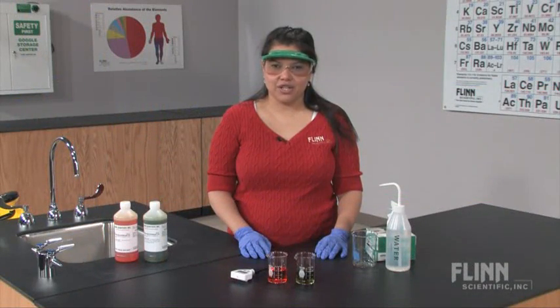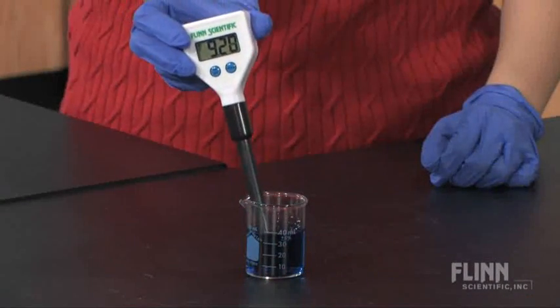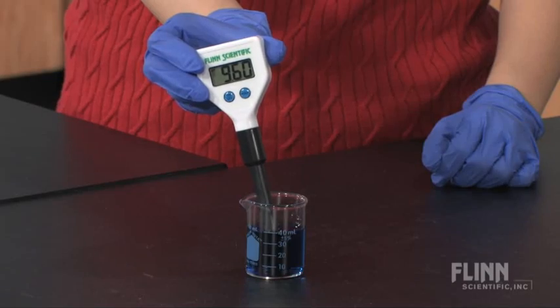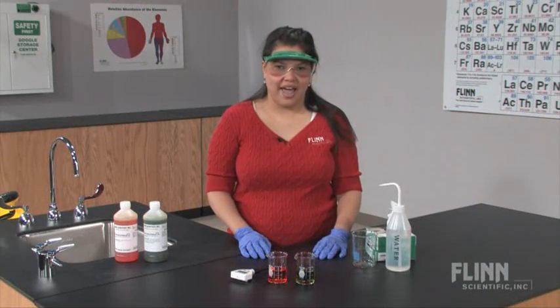Avoid long lines and bottlenecks at your pH meter in your lab with the portable Flynn Scientific pH meter, priced so every student group can have one.